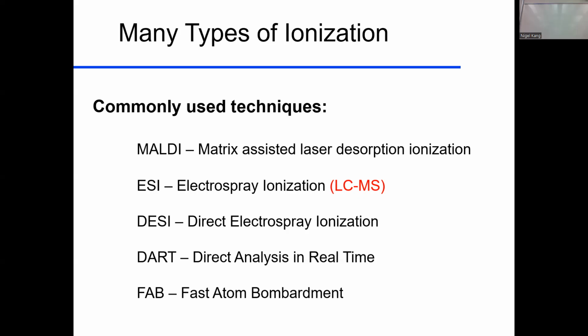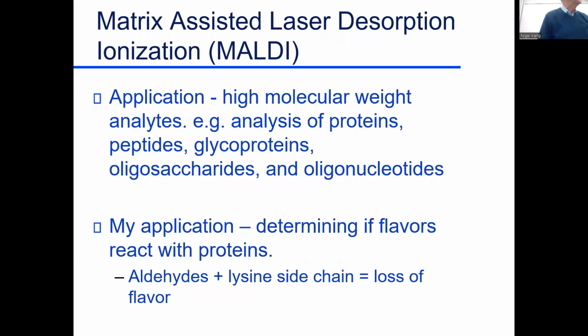None of these will actually interface with the gas chromatograph. This will interface with liquid chromatograph. These are all standalone methodologies. There's nothing feeding them. And one of these systems is used in airports. If you're looking at drug screening, what that person does with that swab, puts it in this mass spectrometer that happens to be sitting there. Okay, looking for bomb dust, so to speak.